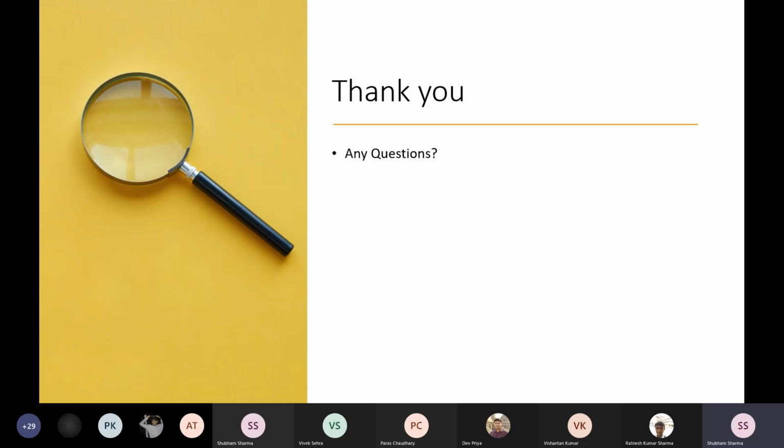If you have any questions, please ask me now. Ma'am, can you please explain again why we are adding NaCl? Yeah, so we are using NaCl because it's an aqueous salt solution, and this will create a biphase, meaning two phases will be created. In the lower phase, we will find the hydrophobic lipids which we want to extract. In the other part, we will get some water soluble impurities. So they can be separated, and we get only the extracted lipids. So we are using this aqueous salt.